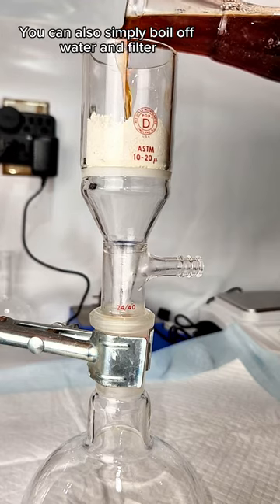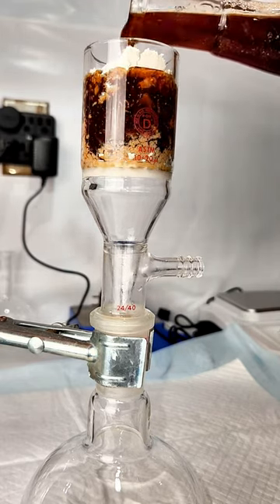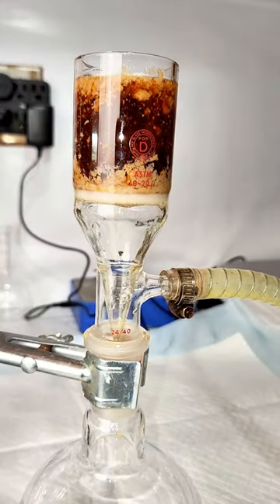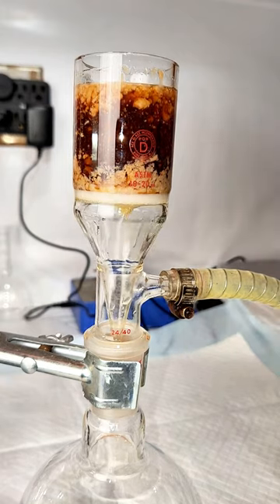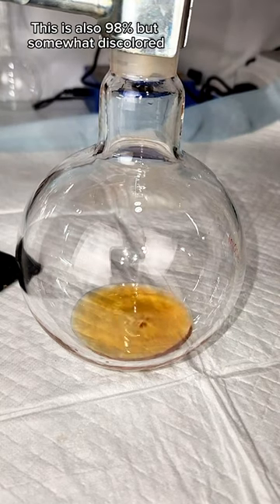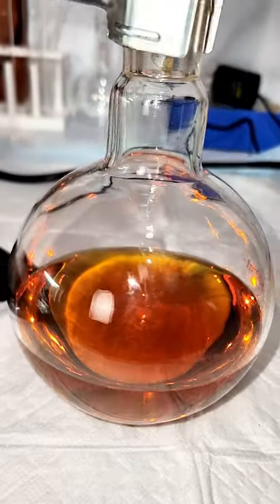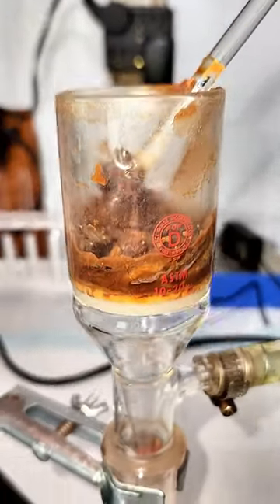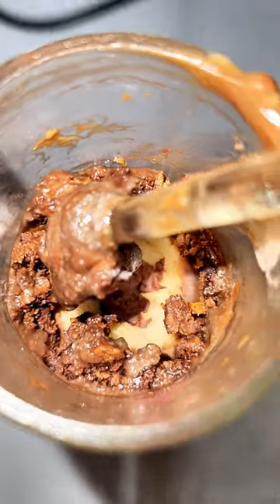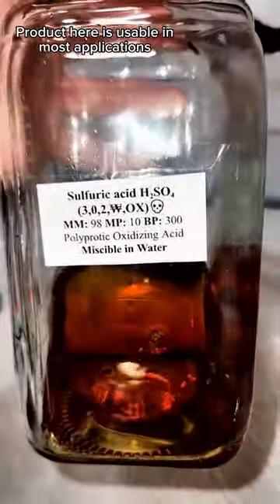The other thing I wanted to show you is another way to process waste sulfuric acid if you're freaked out by distilling over 300 degree boiling sulfuric acid. For this method, I simply boil my sulfuric acid like I showed earlier until all the water is gone and it's giving off white sulfur trioxide gases. The acid is then filtered through celite and collected, and the resulting solution is a clear amber color. This acid is also azeotropic 98%, and it's perfectly fine and usable for anything where a very small amount of contamination isn't a problem.